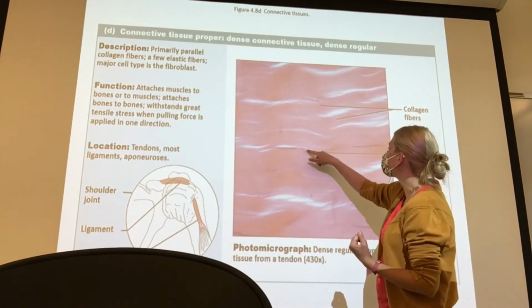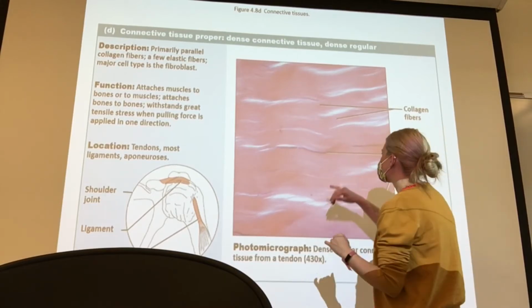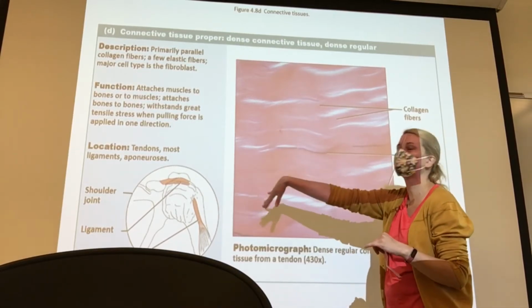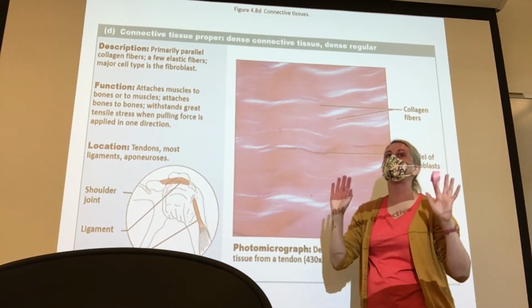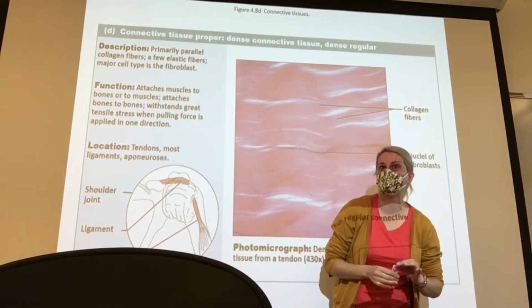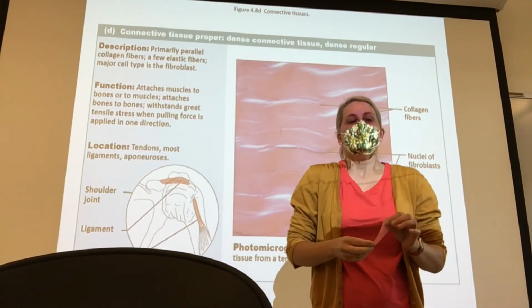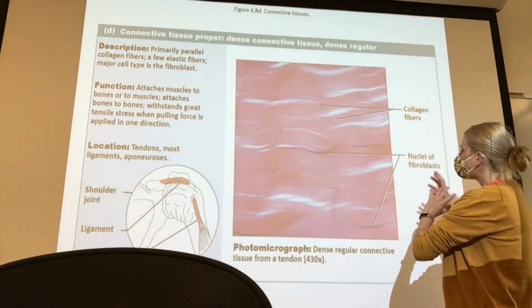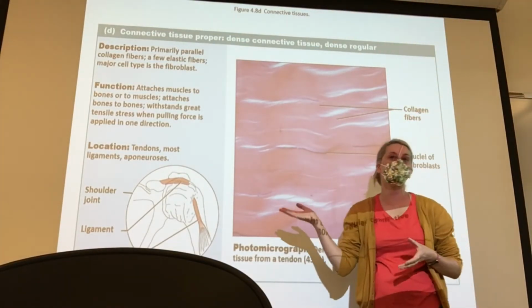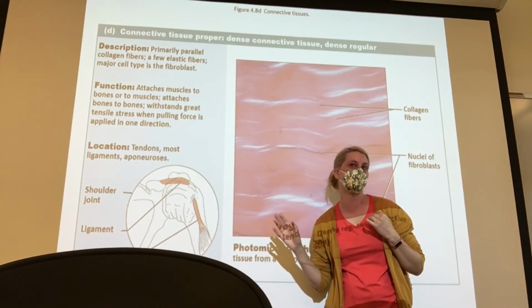And then you have these squished little nuclei. I was thinking of muscles because of the tendon, sorry. They're not really manufacturing a whole lot right now, right? They made collagen in abundance. There's not a lot of matrix, so this is low vascularization, okay? The blood is not really getting in here super well.